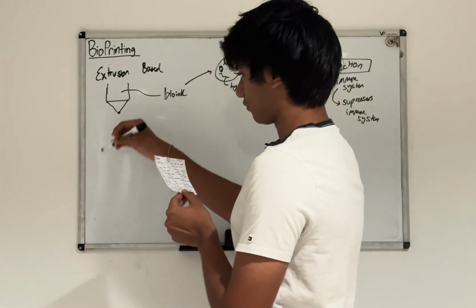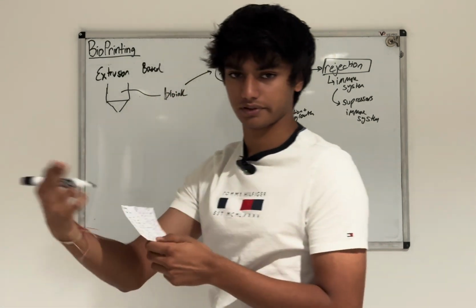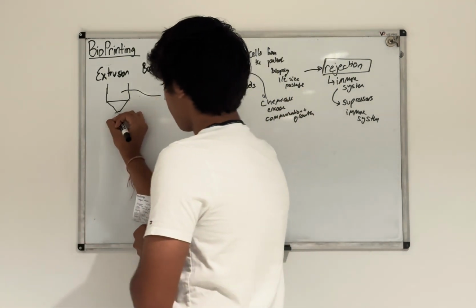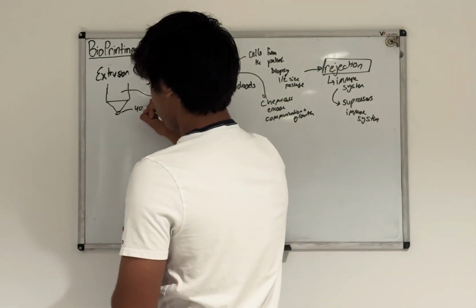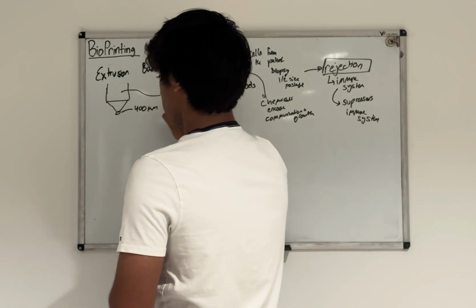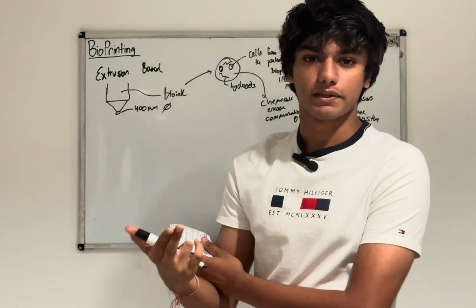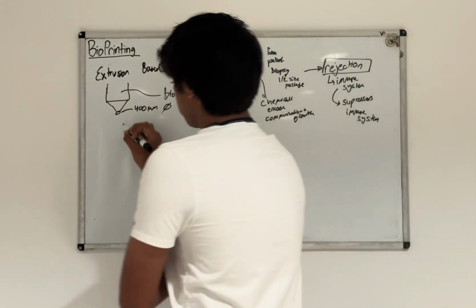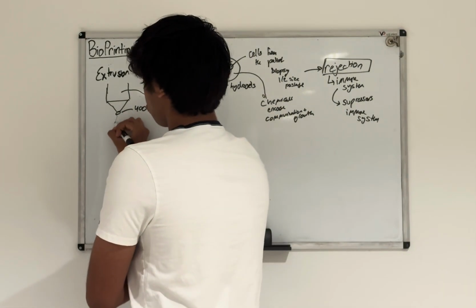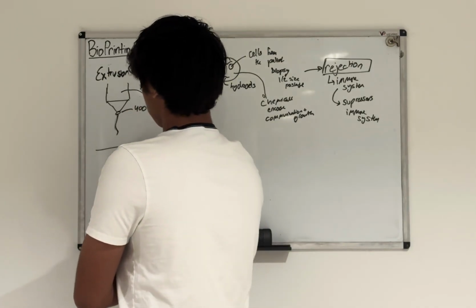So finally, how does it actually get out? On the printer, it's very similar to a printer, right? You have a nozzle, and this nozzle is usually around 400 microns in diameter, no more than that. And so that's really tiny. A micron is 1/millionth of a meter, so it's super duper tiny. And so this nozzle sends a continuous stream of bioink to a dish.